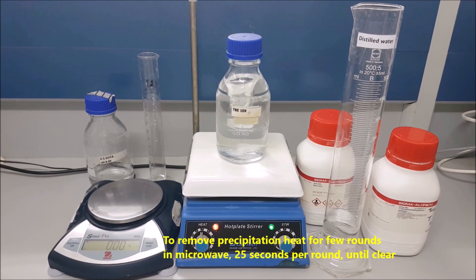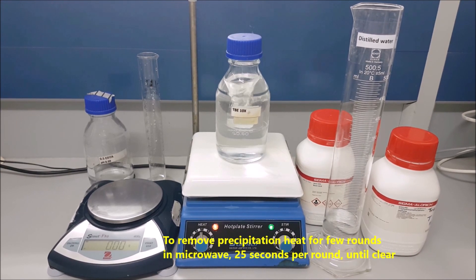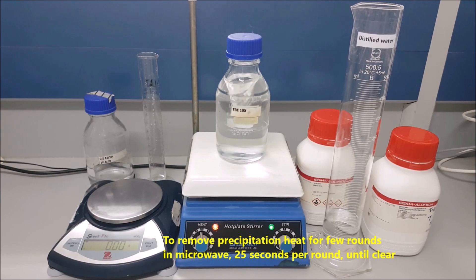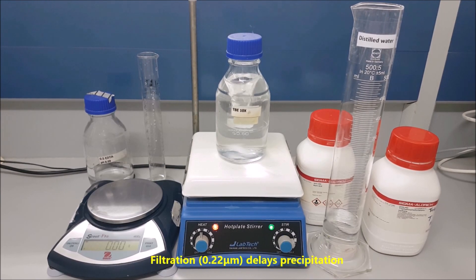To remove precipitation, heat for a few rounds in microwave, 25 seconds per round, until clear. Filtration delays precipitation.